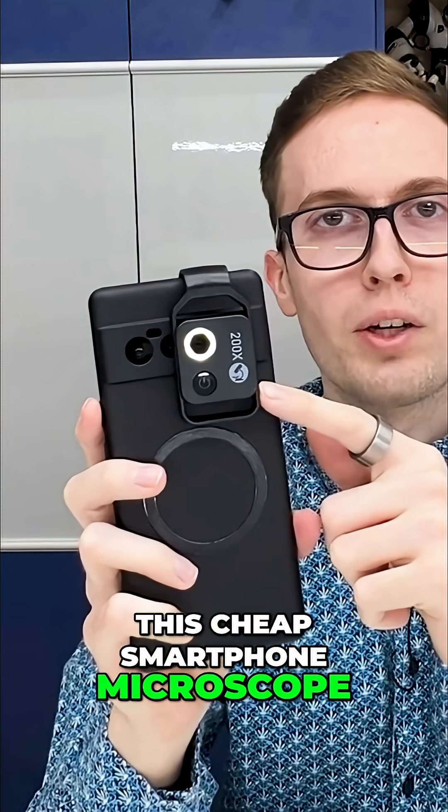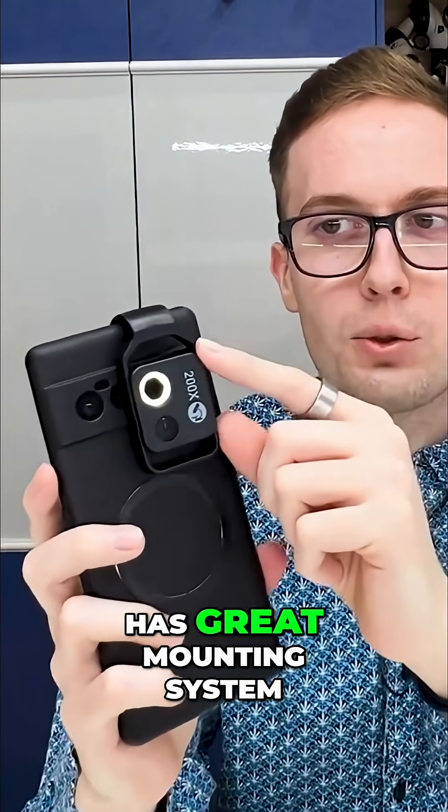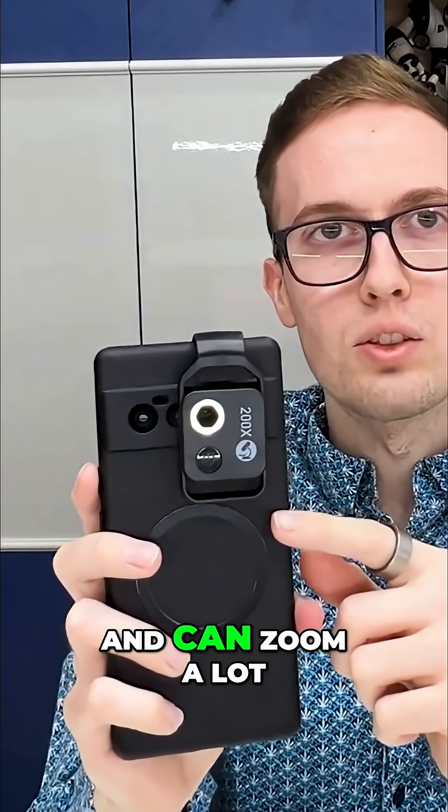This cheap smartphone microscope really positively surprised me — it works great, has a great mounting system, great image quality, and can zoom a lot.